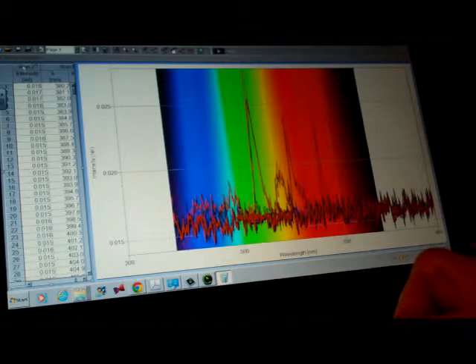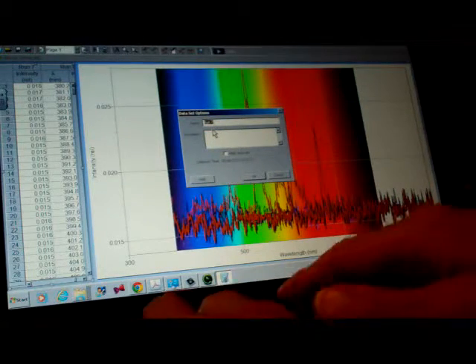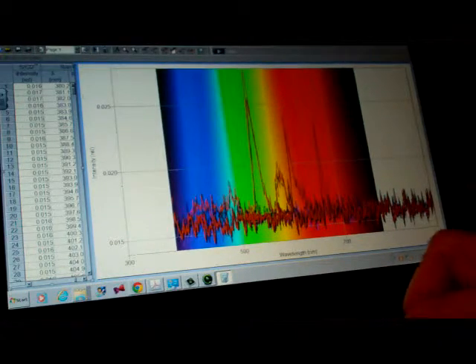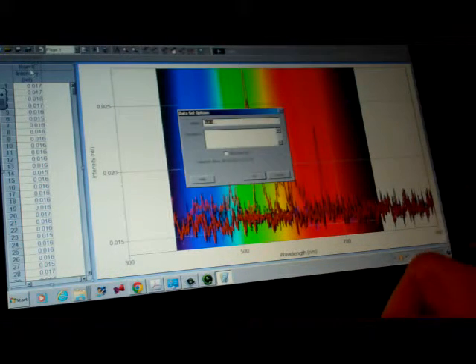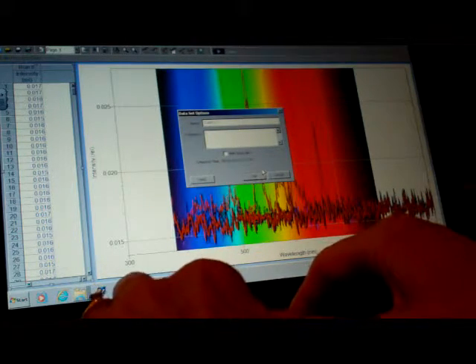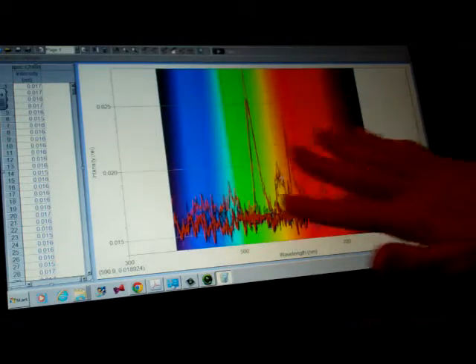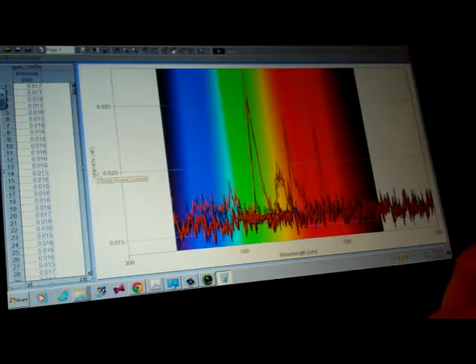Arrowing over under run 7. The last one we tested that was relevant to the lab was strontium chloride. Clicking OK. But then we threw in a bonus. We said we had to run the cupric chloride. So we threw that extra little piece in and click OK. Well, that didn't seem to change much here on the graph until we go to click on the y-axis.